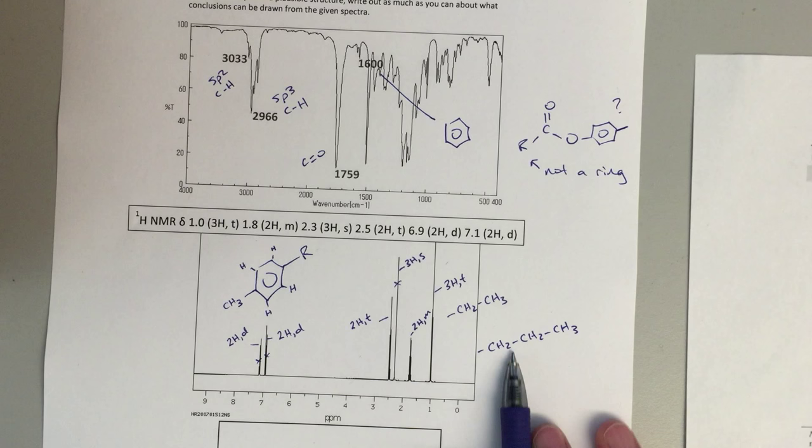The other thing I forgot, we were given the chemical formula. So don't forget about that, C11H14O2. So let's go ahead and count. 1, 2, 3, 4, 5, 6, 7, 8, 9, 10, 11, so C11. H14, so here's 7, 8, 9, 10, 11, 12, 13, 14, and then two oxygens. I think we're in good shape. This looks pretty good.